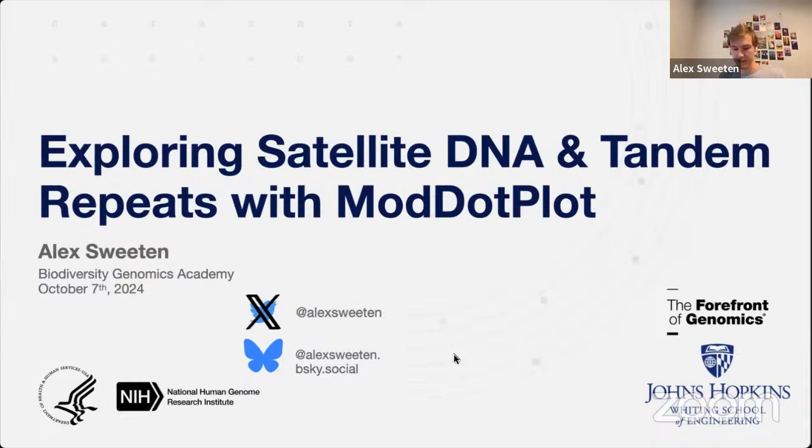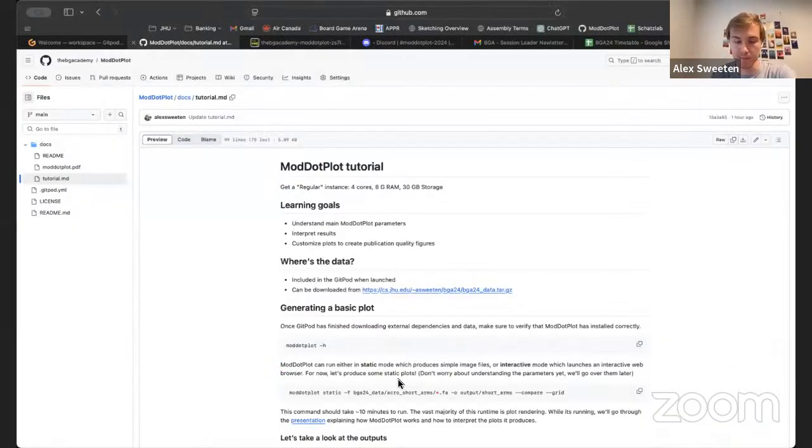Before I get started with my presentation, I want you to go to the Gitpod and make sure that everything works, and also run a sample command while I give the presentation, just so we save some time because we only have an hour today, and also to make sure everything works the way that it should.